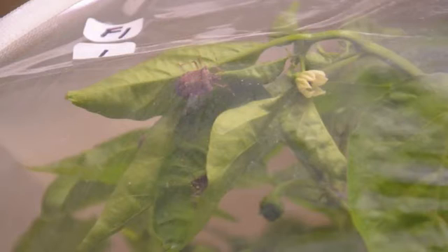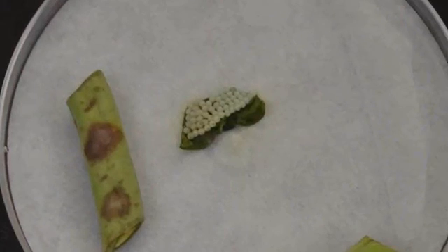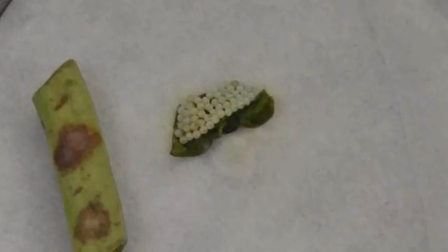Every two to three days I check those plants for eggs, and if I find an egg cluster, I collect it and keep it in a petri dish.